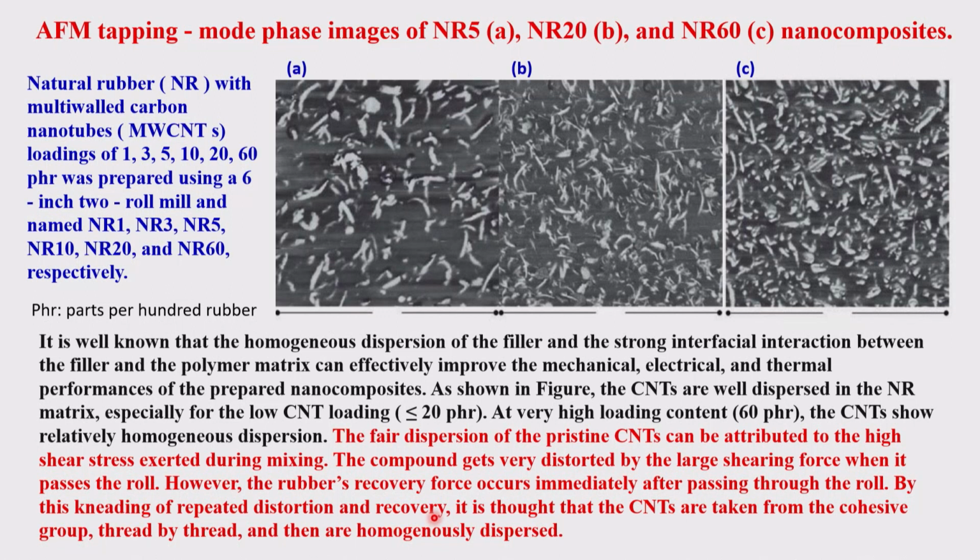Okay, let us look at one example. Here the tapping mode is used. In some cases I have not mentioned it, but it's not very important. Because you're looking at it analytically, you're comparing and expecting that all of them are done in the same kind of mode. So therefore there is no problem.